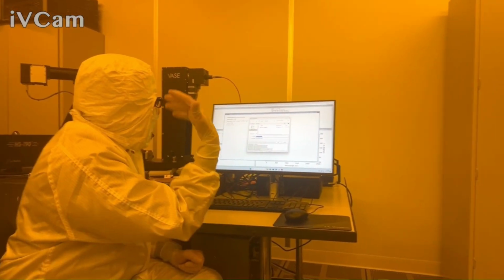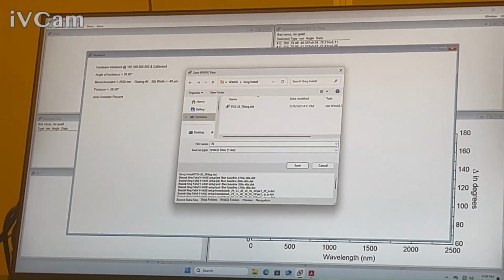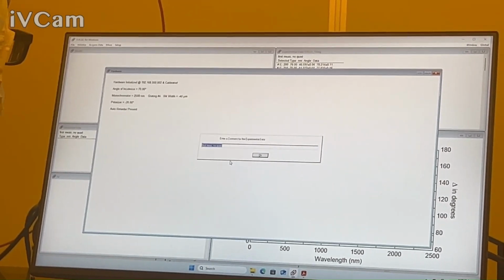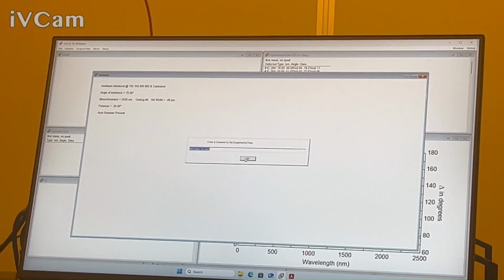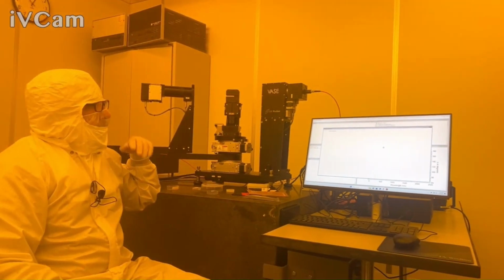But especially this is the initial setup. We're going to do that air scan. We're going to at least measure, if hopefully I set that right. I just want to push the stage out of the way.